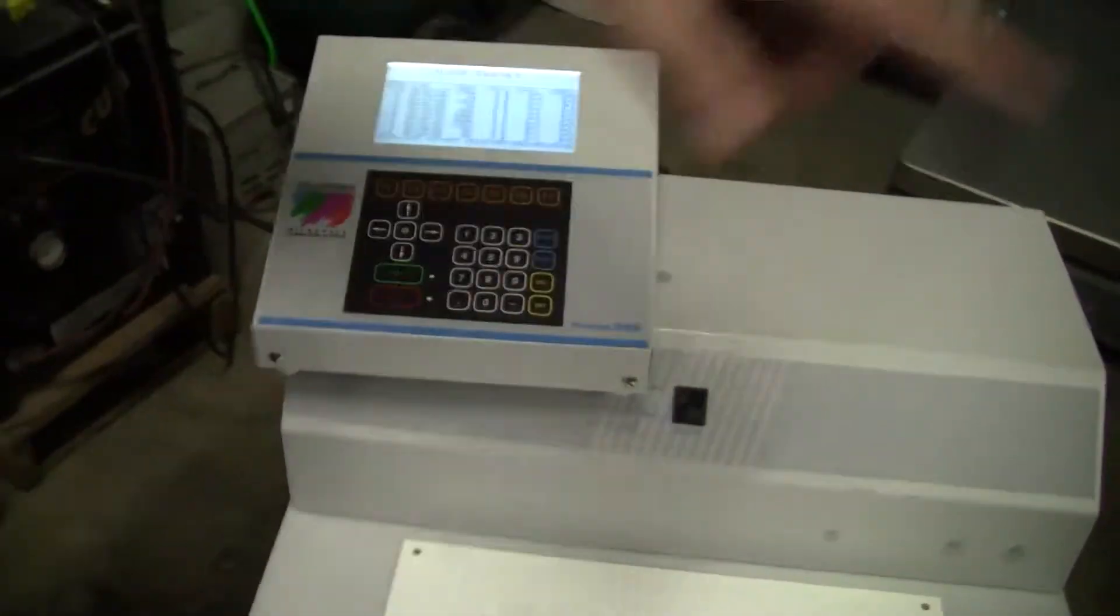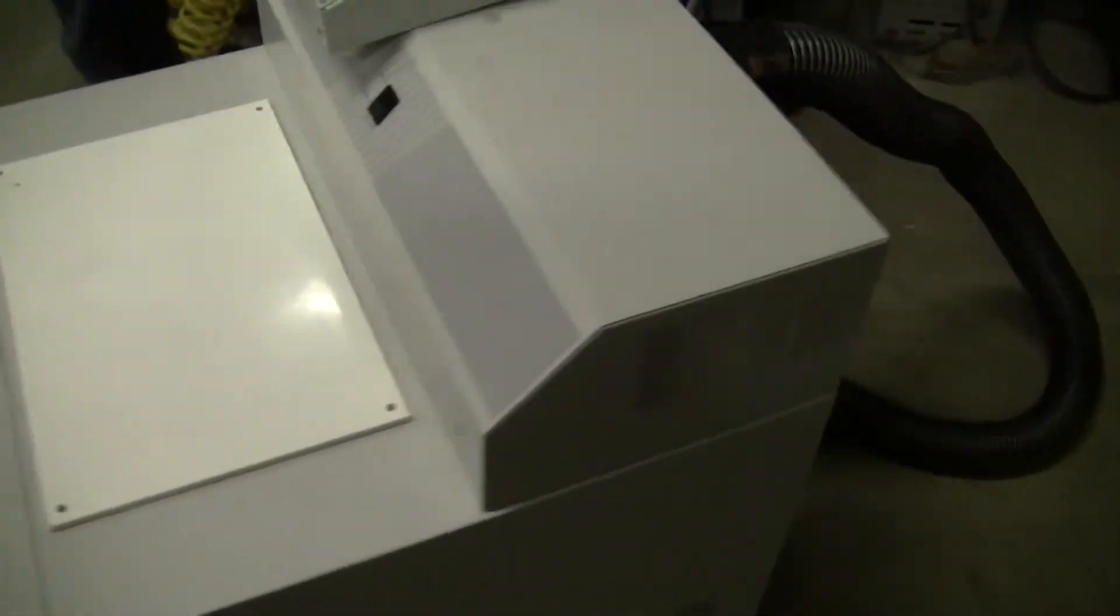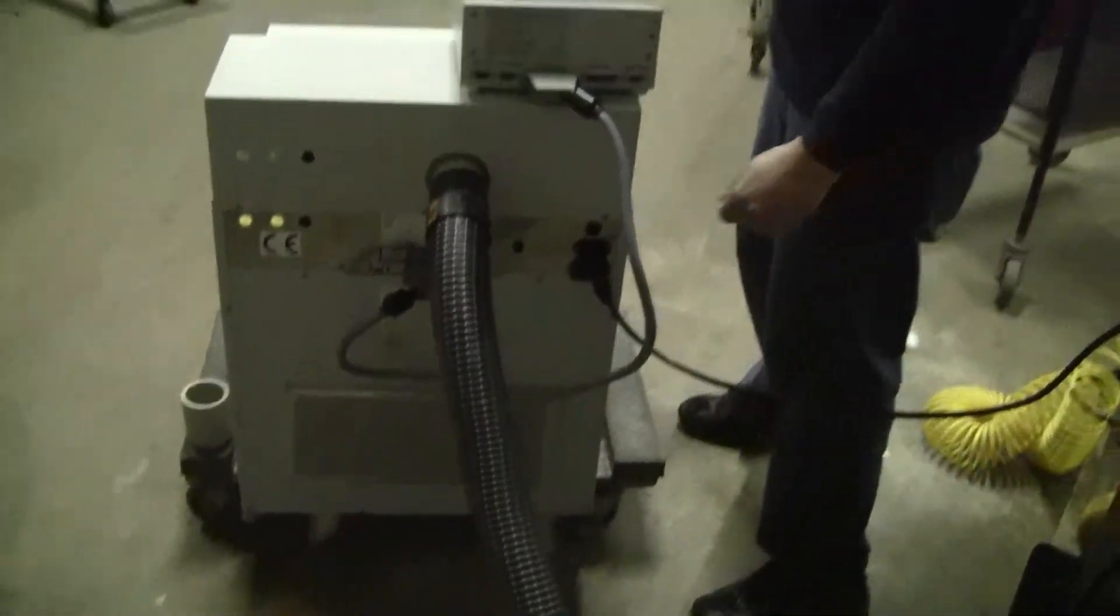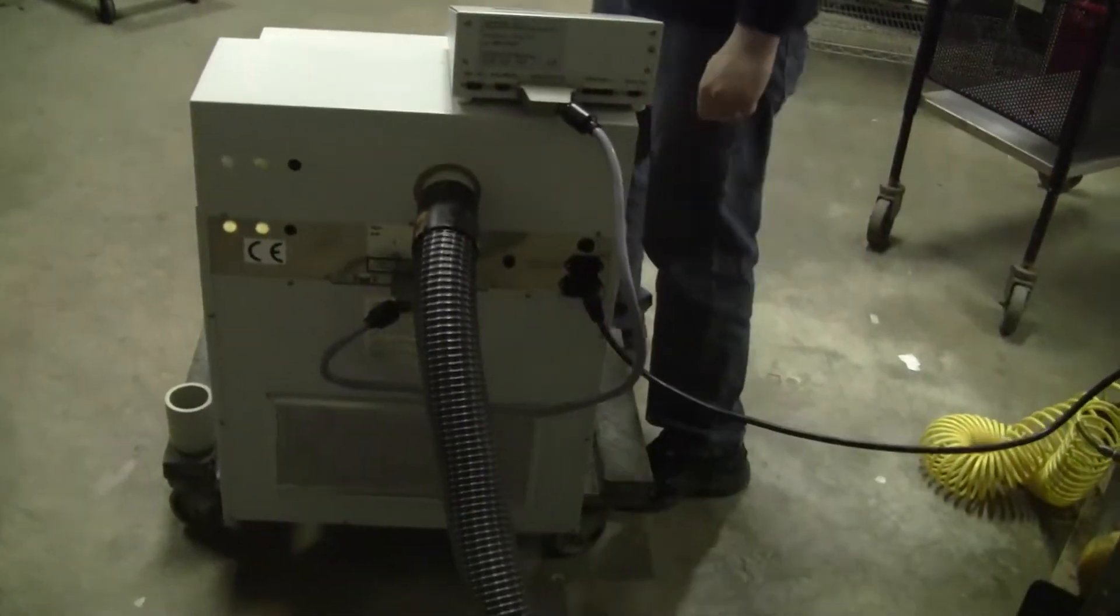I'm going to stop it. Let's take a look at the back. There's a communication cable going down. We don't have any of the other accessories. It runs on 220 volts.